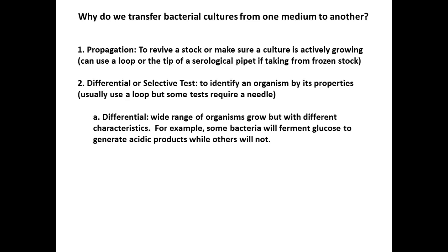So in the case of the blood agar plate, those organisms actually poke holes in the red blood cells to get at the hemoglobin inside. And more so, they're after the iron component of your hemoglobin, because they need iron just like we need iron. They need it for their metabolism as well. So that's why they attack our red blood cells if they can. It's a very rich source of iron. Other things that we see are fermentation of sugars, right? We can detect this using specialized media.